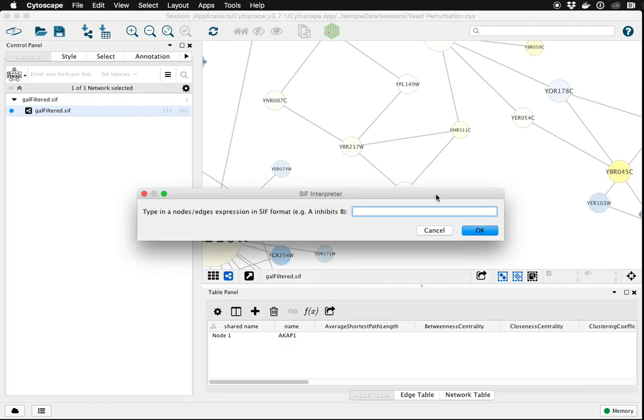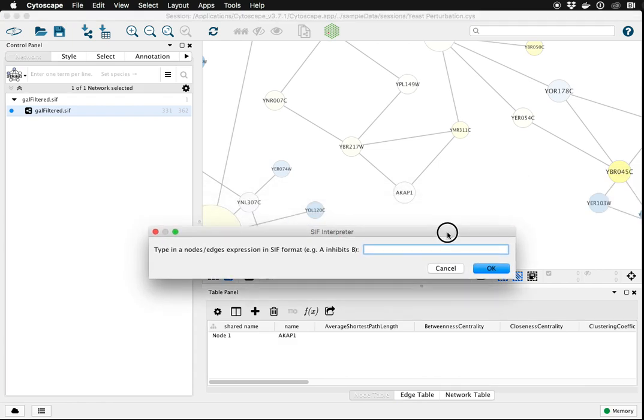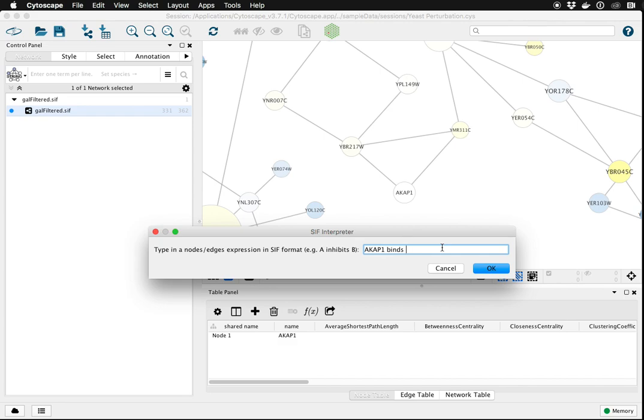The way this works is you simply type in the name of the source node, say ACAP1, and then the name of the interaction type, for example binds, and then a space and the target node. You can again type an existing node, or you can type a new node, and you can type more than one node.